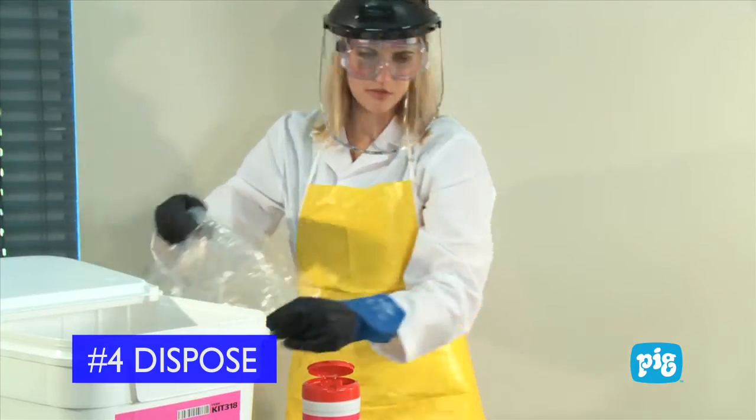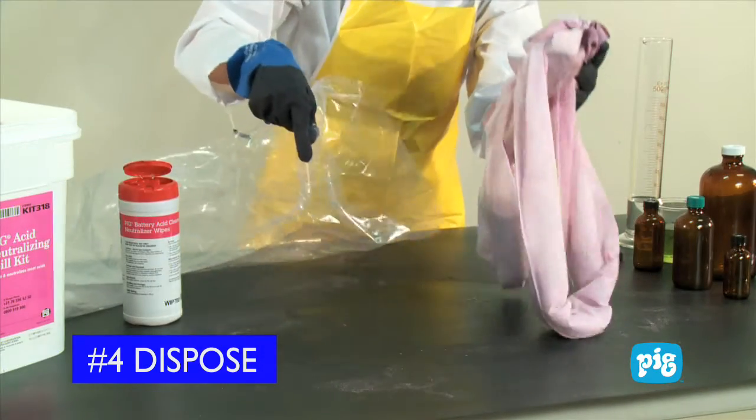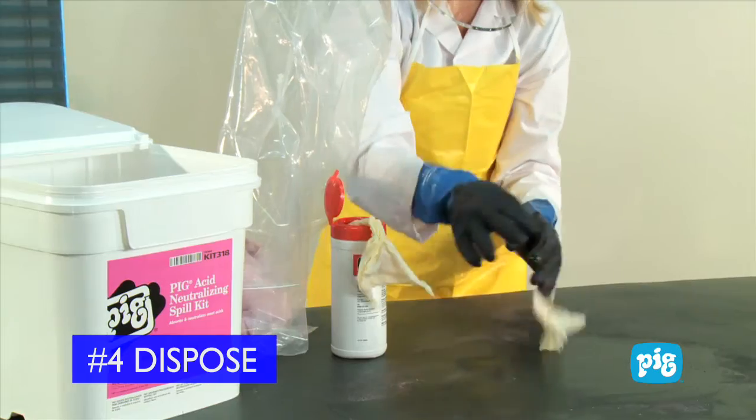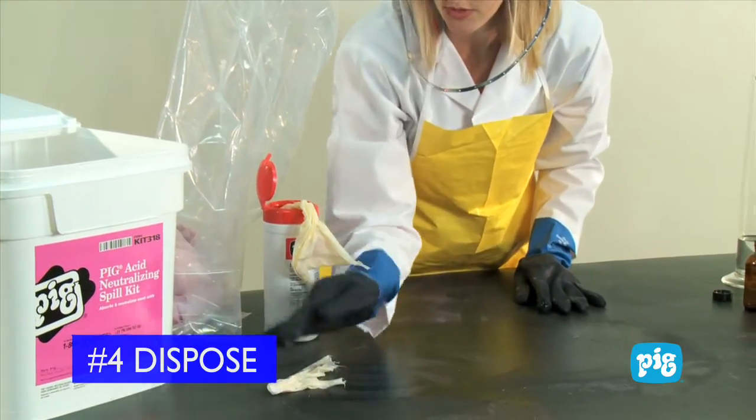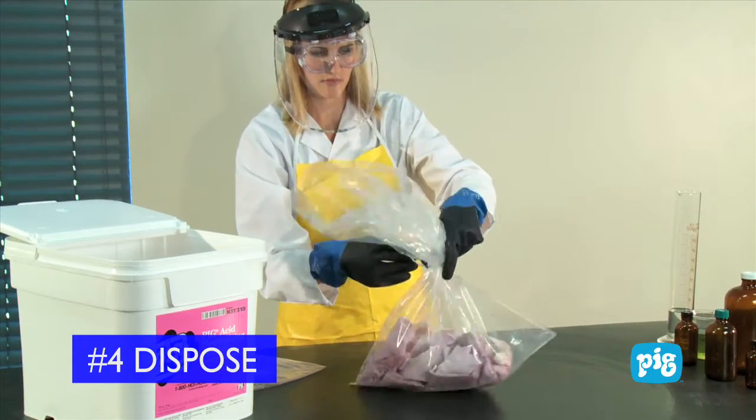Step 4: Dispose. Place all absorbents and other contaminated items in the temporary disposal bag. The pre-moistened wipers can be used to clean up any acid residue remaining on the surface. Dispose of these in compliance with local, state, federal, or country regulations.